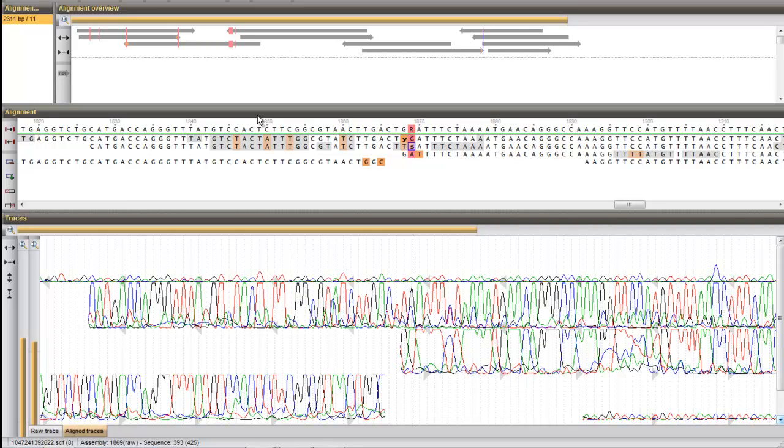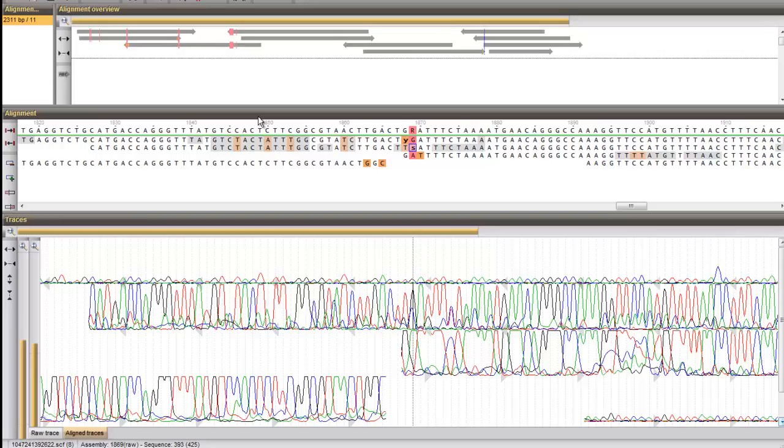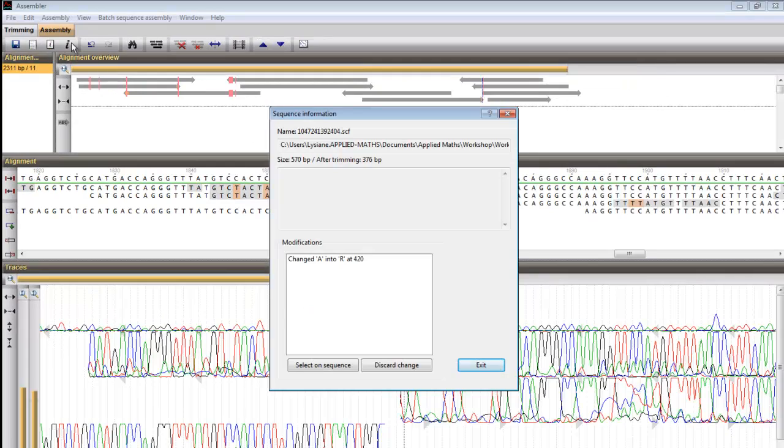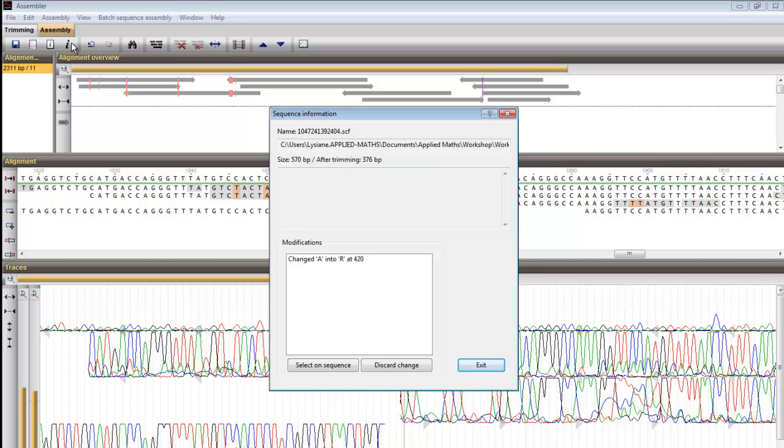All modifications made to a partial sequence are listed under the information button, and can be selected and or discarded from within this dialog.